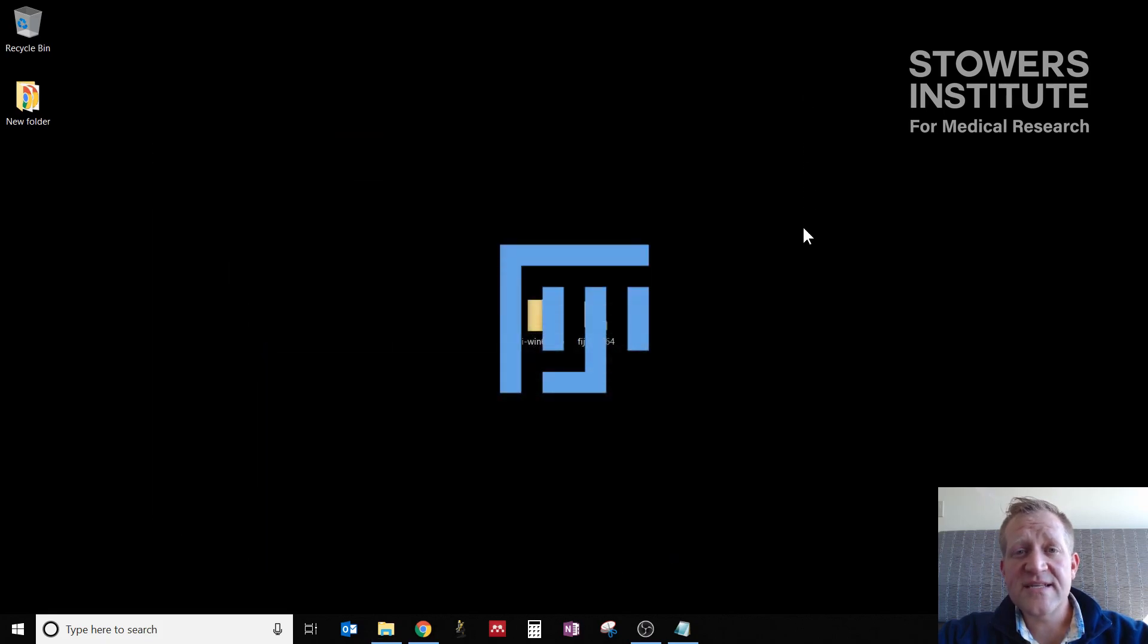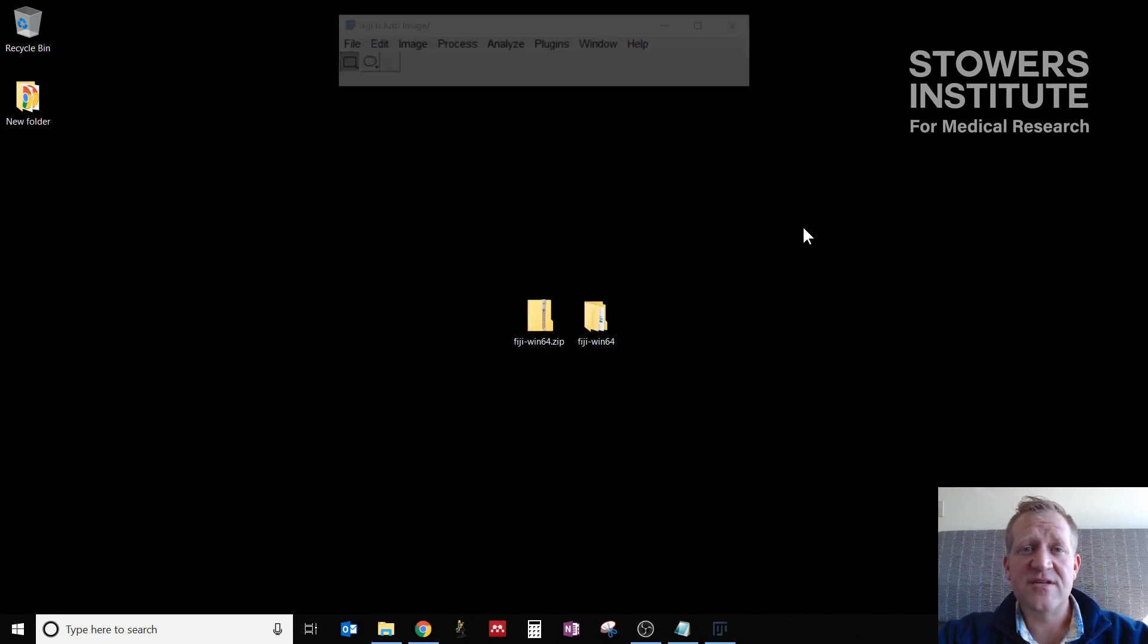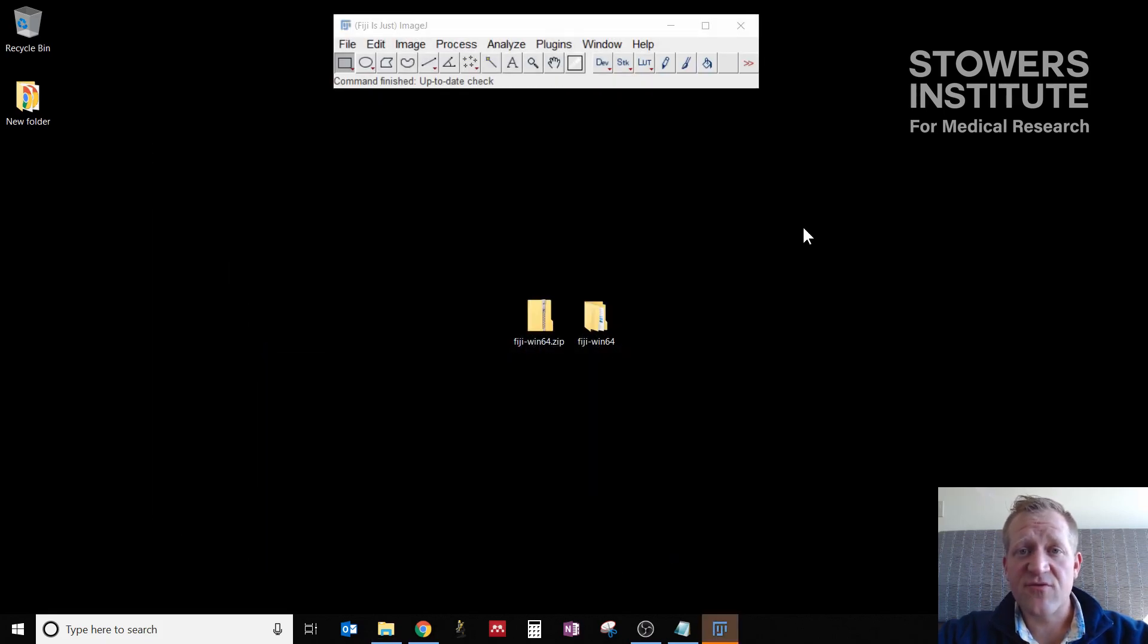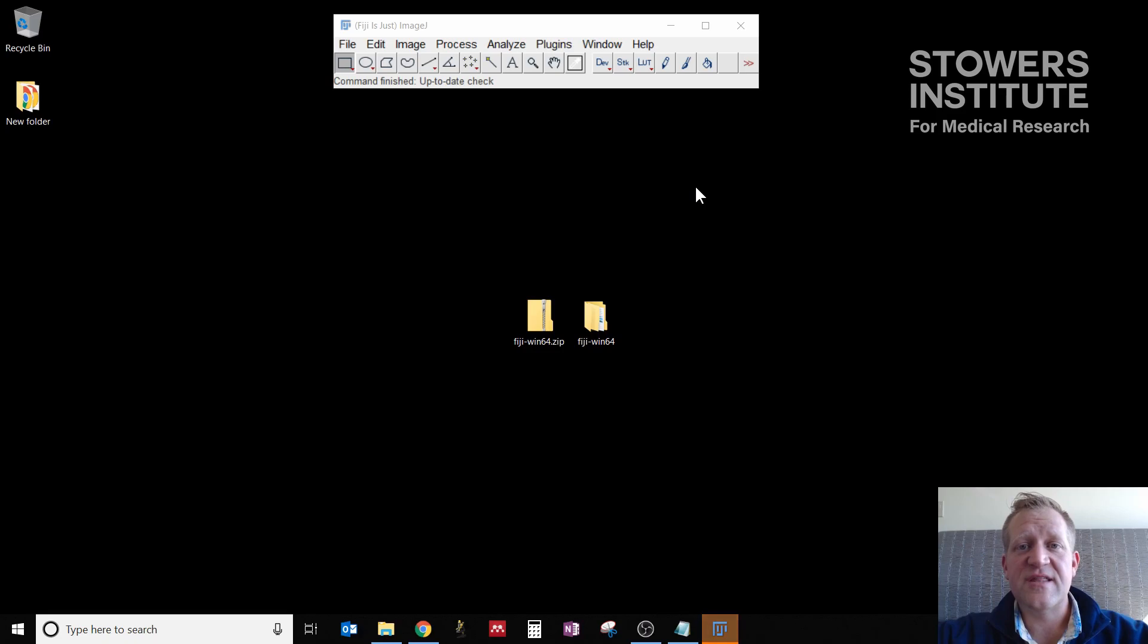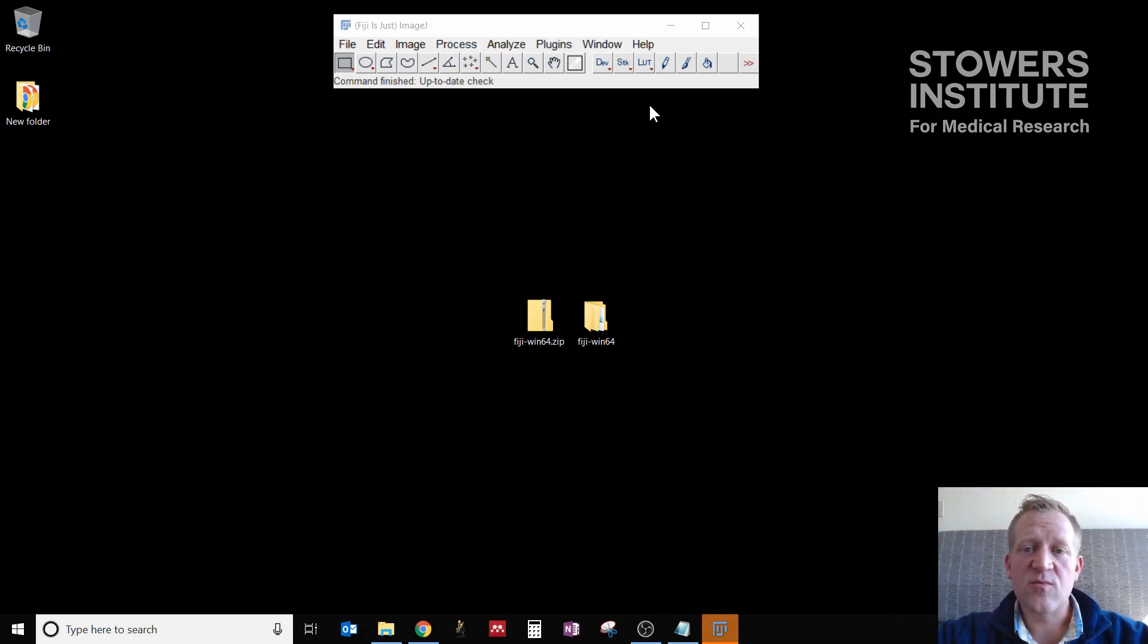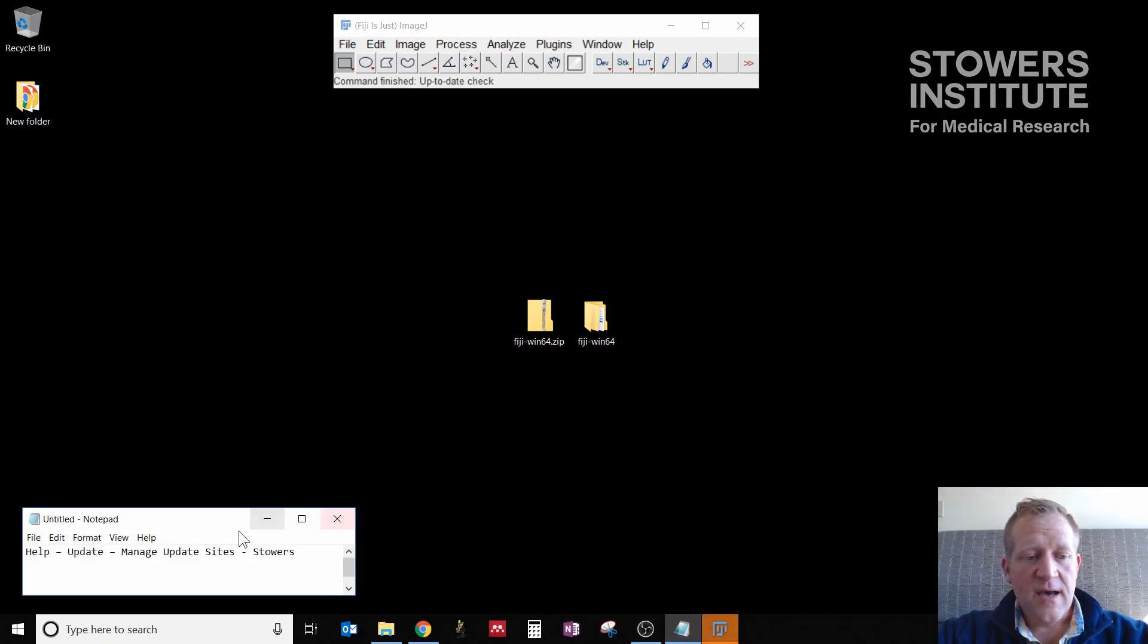Now we have only two things to set up to get Fiji into a usable state for us pretty quickly, for specifically the things that we want to do. And to do that, you're going to want to pull up Help and go to the Update Site.